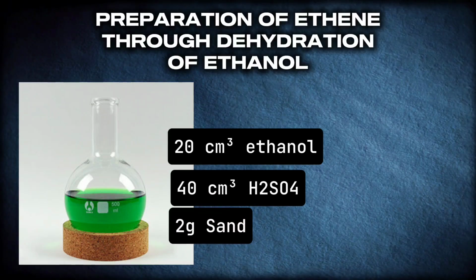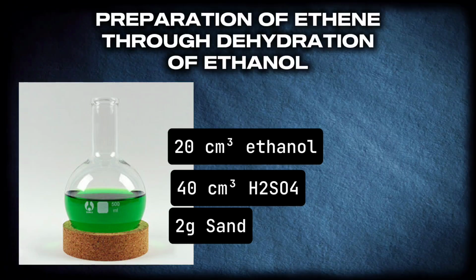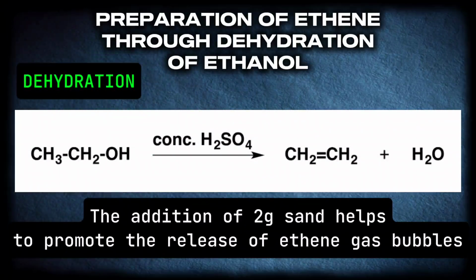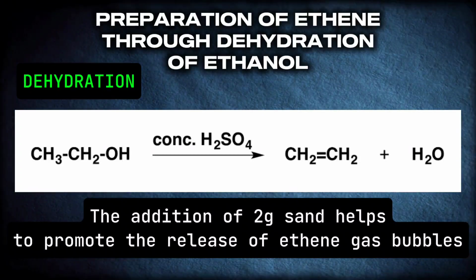And that is followed by the addition of some sand. It's going to serve as our granules to help foster the generation of gas bubbles, that is the generation of the ethene gas. All right, it really does not have so much impact or significance, but this is what it's going to do to help generate the ethene gas to bubble out from the system.